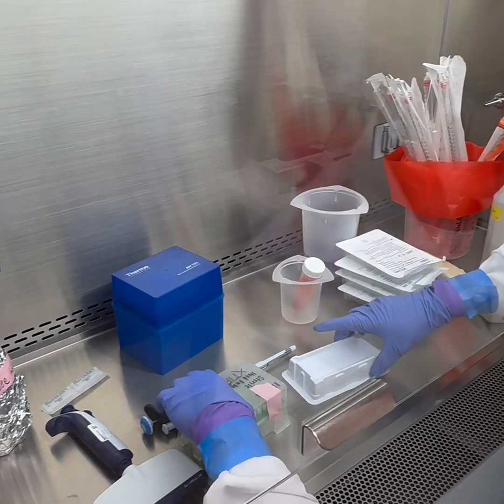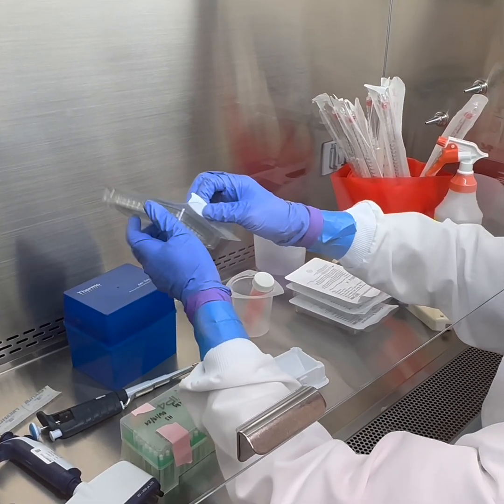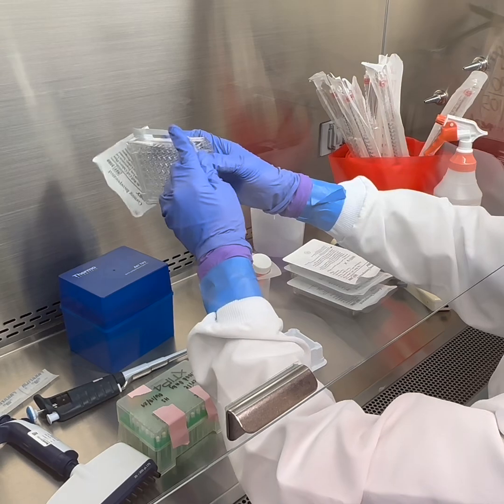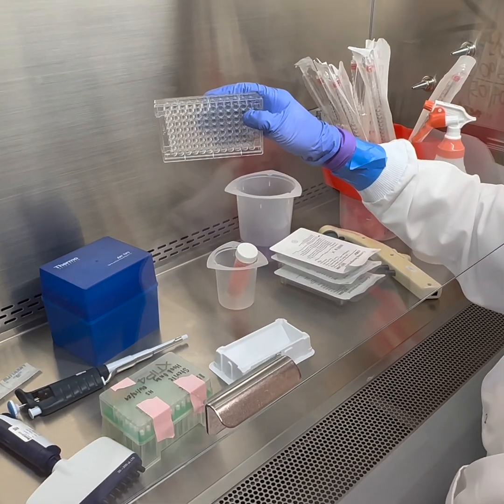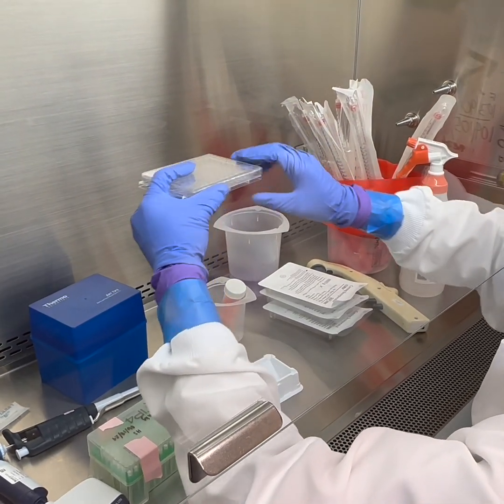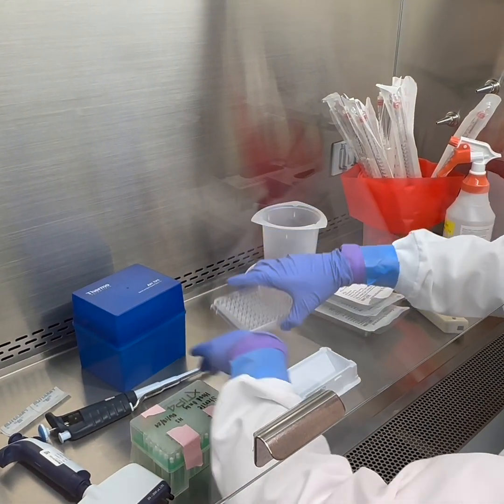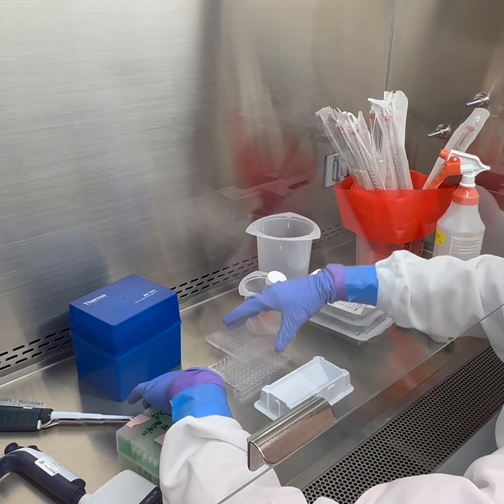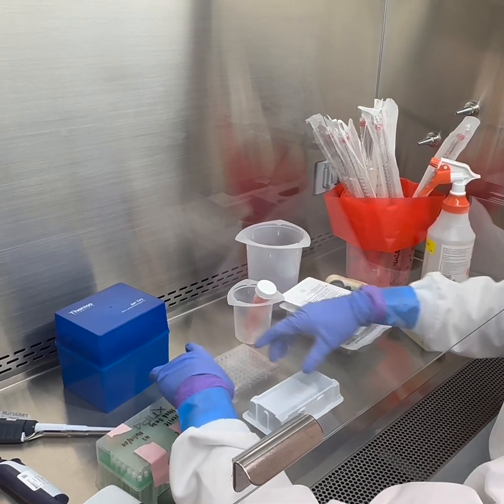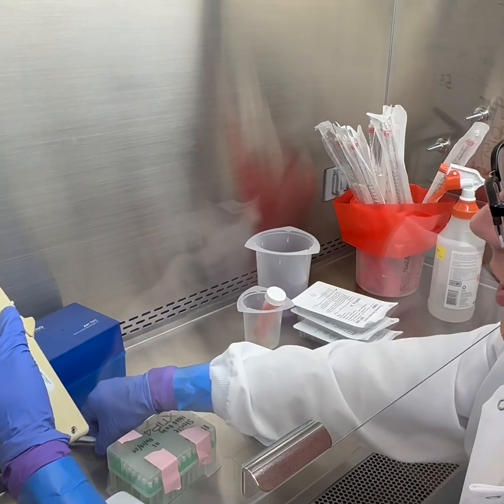All right. So I'm going to open a plate. You should have a marker in here too when you do this, but you can do it after as well. You're going to want to label your plates with your name, the date, what's in them. So Candida albicans or Candida auris, XTT, and then plate number 1. You can also choose to include the compound you're testing against for the XTT assay. Great. These ones come with lids, and it's going to be 100 microliters per well.